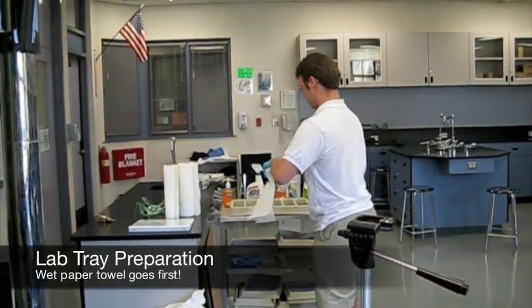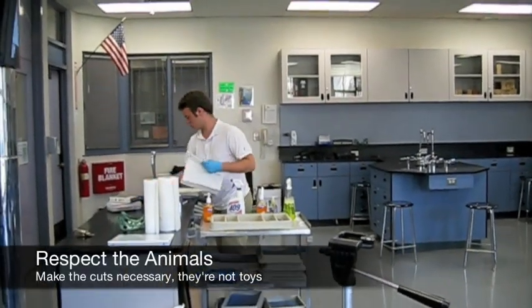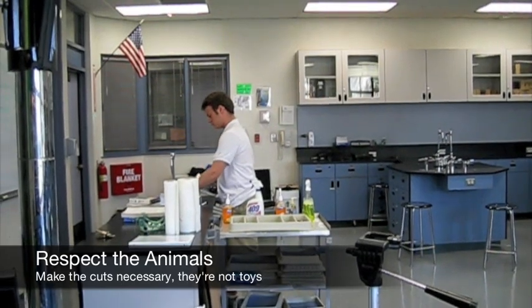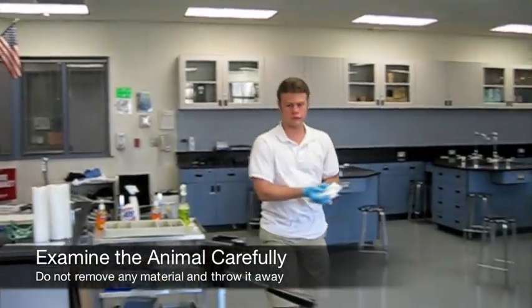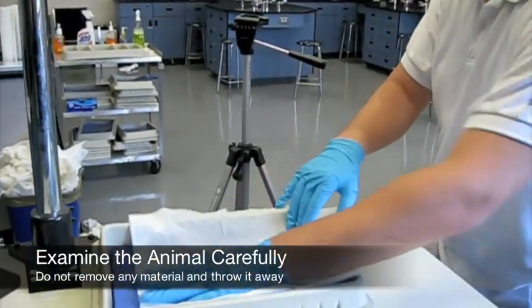To get your lab tray ready, place a thick layer of wet paper towel down. One thing to keep in mind whenever you are working with these animals — these are educational specimens, not toys. Make the cuts that are necessary to examine the animal, but respect the fact that this was once a living organism. Don't make unnecessary cuts, and don't remove anything from the animal and throw it away. Whatever you remove, you will eventually put back.